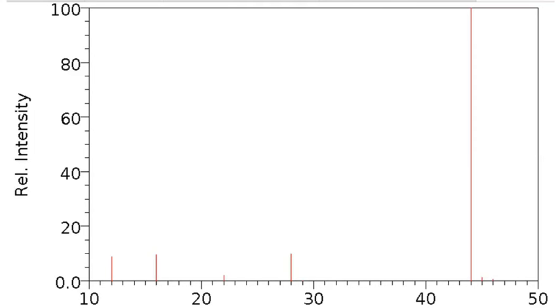Okay, last one we're doing together. This one's a little bit trickier because it's not an element, it's a compound. So compounds can get blasted apart into more variations than elements because they're made up of more than one element. Go ahead and pause the video and try to predict what compound this is and what causes each of the peaks.